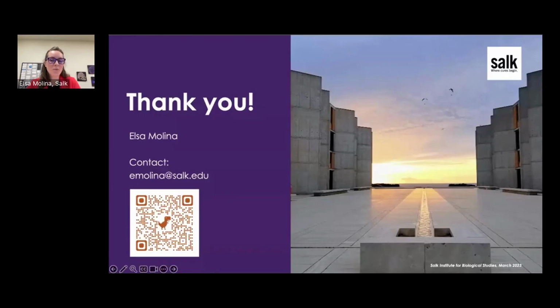Yeah, so what I really would like to see is more reliable, so we are sure those transcripts exist, and faster, definitely faster, because sometimes it's very long to analyze a big piece of tissue. So definitely that is more exciting for me, like the area and the question: is it true? Can we trust the data? So this is for me the main question.